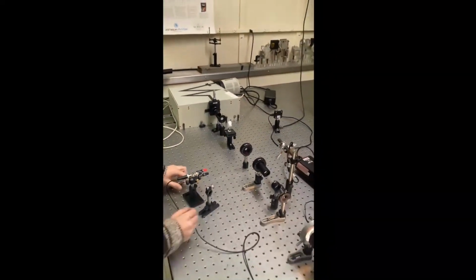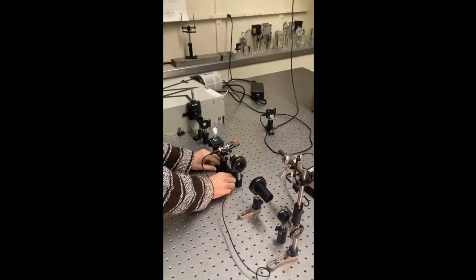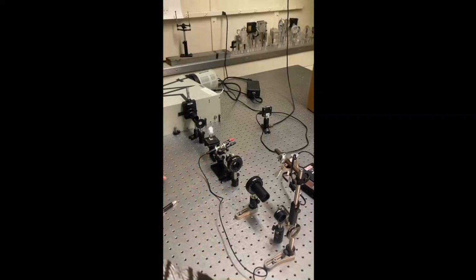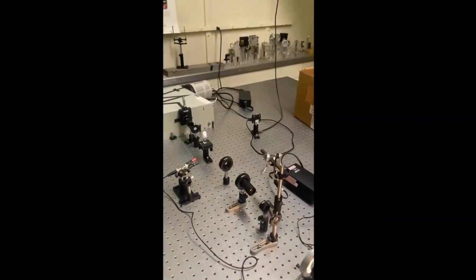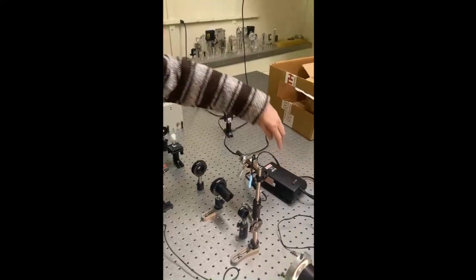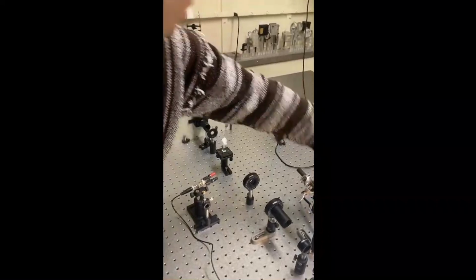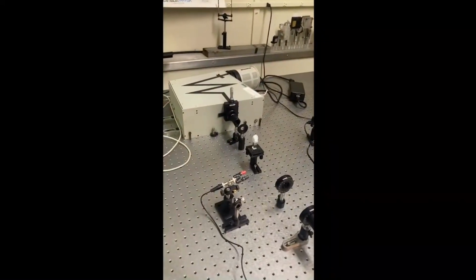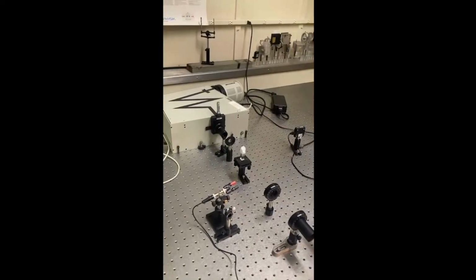From our experiment, we also used a photodiode and another linear polarizer to configure circularly polarized light using intensity. From there, once we had that, we calibrated the monochromator using a mercury-argon lamp. And then from there, we calibrate the data for intensity distribution.